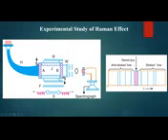Otherwise, in terms of frequency, the higher frequency lines are called anti-Stokes lines. The lower frequency lines are called Stokes lines. So basically, the Raman spectrum consists of symmetrically placed Stokes and anti-Stokes lines with respect to the parent high intensity line. So this is the experimental arrangement, and this is the observed Raman spectrum.